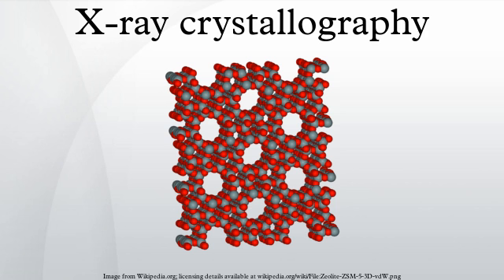In practice, favorable conditions are identified by screening. A very large batch of the molecules is prepared, and a wide variety of crystallization solutions are tested. Hundreds, even thousands, of solution conditions are generally tried before finding the successful one. The various conditions can use one or more physical mechanisms to lower the solubility of the molecule. For example, some may change the pH, some contain salts of the Hofmeister series or chemicals that lower the dielectric constant of the solution, and still others contain large polymers such as polyethylene glycol that drive the molecule out of solution by entropic effects.